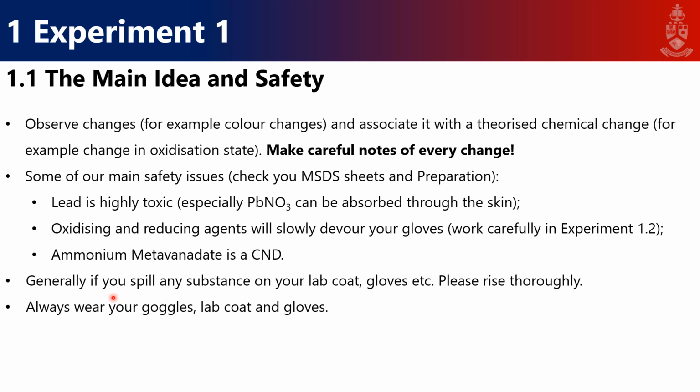Right. General advice is if there is a spill on your lab coat, gloves, or etc., rinse thoroughly, act quickly, and remain calm. You won't die within the first few seconds, as long as you act quickly. And as long as you wear your goggles, your lab coat, and your gloves, you will be fine.